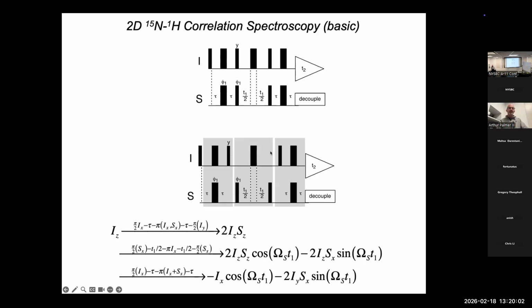No chemical shift evolution here because this is an echo. So we stay minus RY magnetization. This is an X pulse. This will put minus Y on minus Z, and then a 180, and we're back on plus Z.